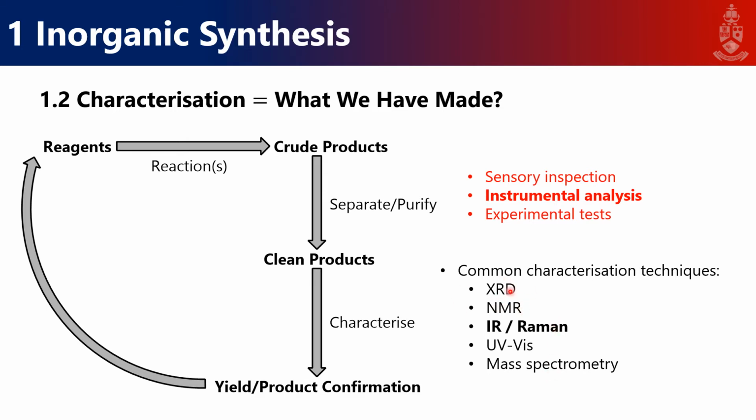And other things like XRD is what I do, single crystal and powder XRD. But anyway, essentially, we can use instruments to see whether or not we have a clean product and to confirm we've made what we set out to make. So the theory: we predicted we have some reagents, we predict products. Now we've made the product. Do these predicted products and our experimental products correlate? Are they the same thing or are we wrong? That's the big question we want to answer.